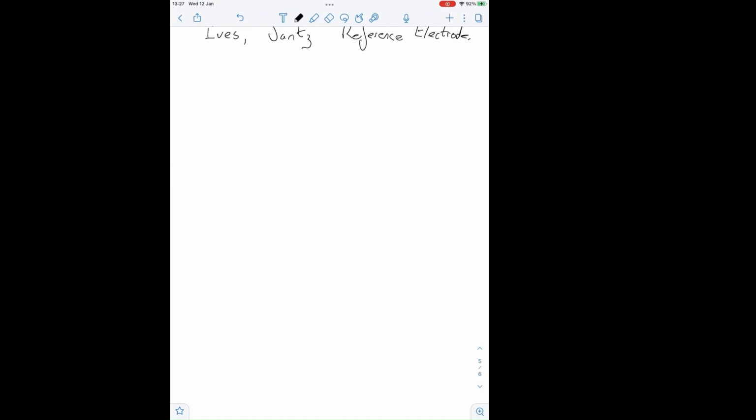So there are other things you must do to get good results. The other one is to be able to use your potentiostat correctly. We're now introducing current measurements, and the simplistic way to introduce current measurements would be: there's my reference electrode, I'm going to measure a voltage and vary that voltage, and I'm just going to measure the current running through the circuit with my working electrode. A simple 2-electrode measurement, with an ammeter here: vary the voltage, measure the current. There is nothing wrong with that experiment, except it's going to give you rubbish.